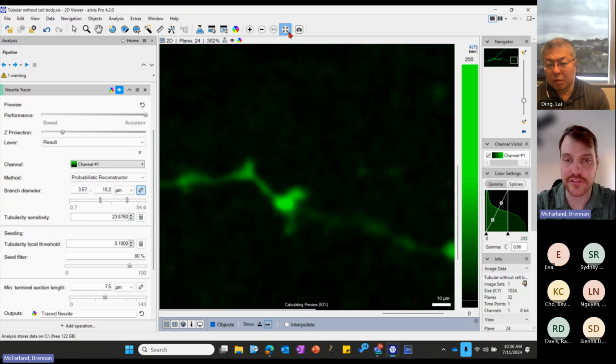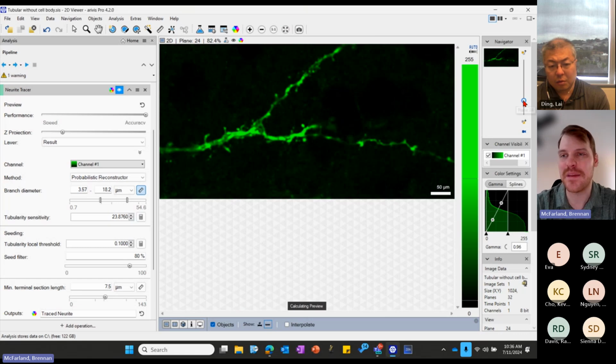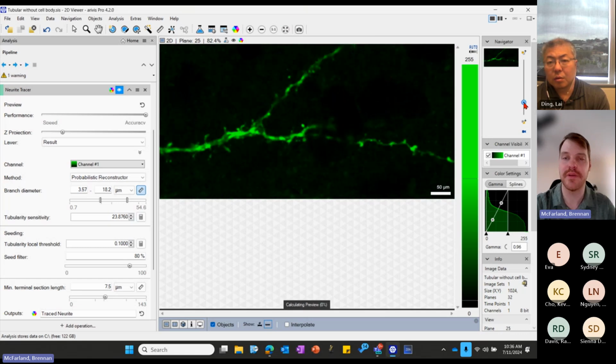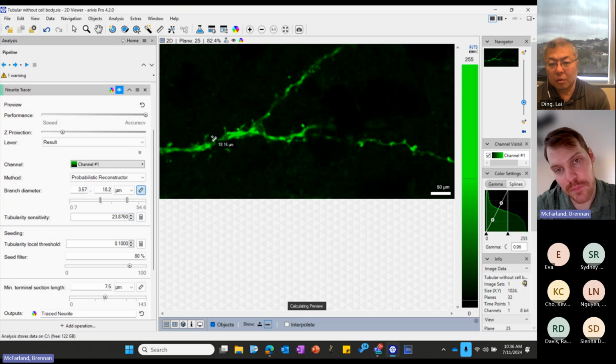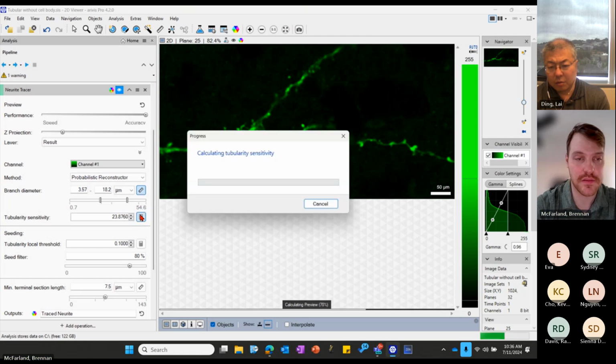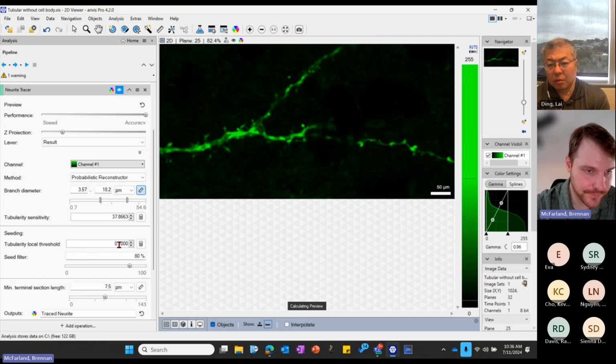So usually I'll find a nice area where the software has a little bit of a tough time. So maybe if I find it messes up in this region a lot, then I'll use this to keep in focus. Then I'll hit something like this.